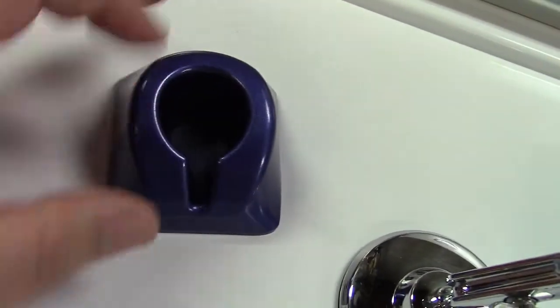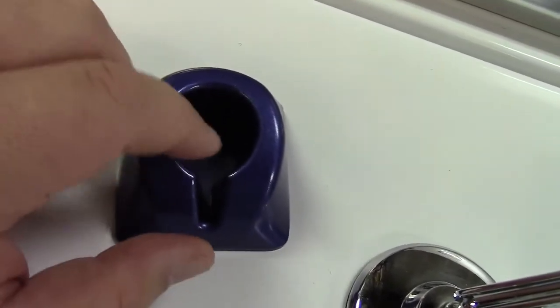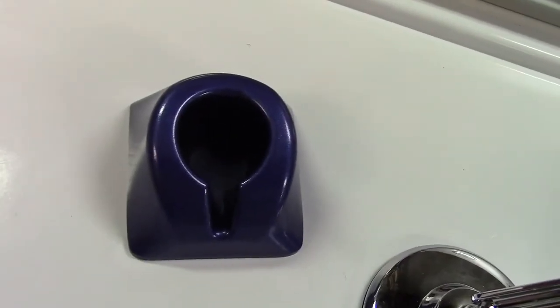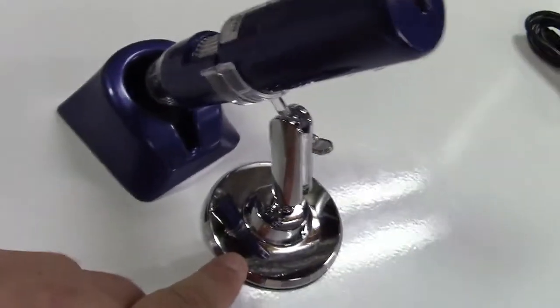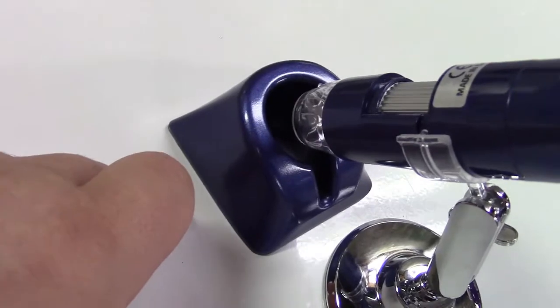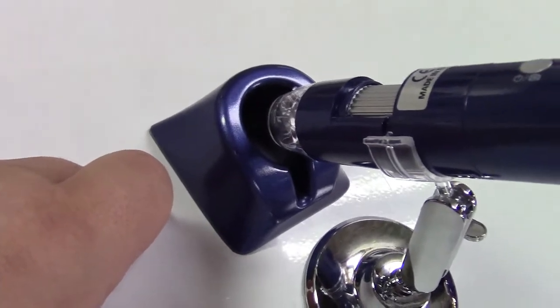I suppose you could put whatever you want to photograph in there, and it may provide for a better picture quality by doing that. So just to give you an idea, you could set it up like this on the stand, pointing into that, where you could put whatever specimen you'd like to photograph with this.